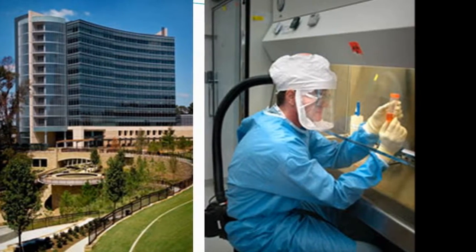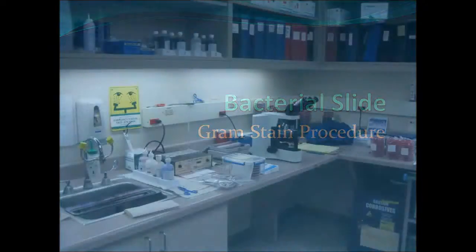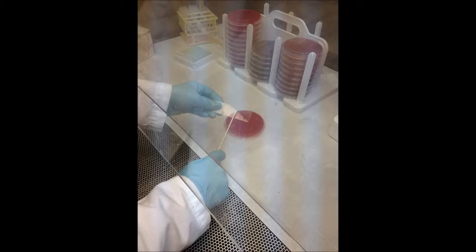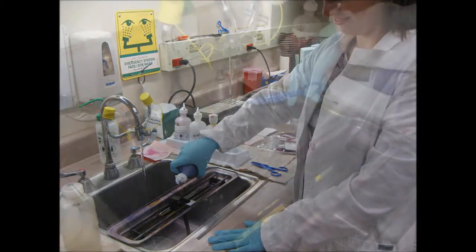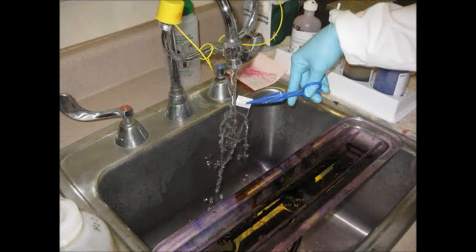To identify an unknown bacteria, the gram stain technique is used first to categorize the bacteria as either gram-negative or gram-positive. To begin, the biological sample must be applied to the slide and then heat fixed by putting the slide on a hot plate until dry. The slide is then stained with crystal violet and rests for 1 minute before being washed. Then gram's iodine is applied and again must rest for 1 minute before rinsing.